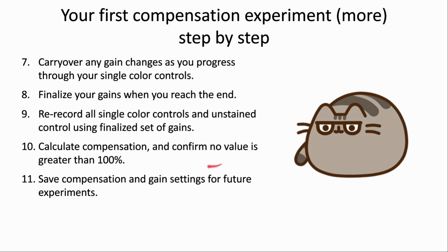Calculate your compensation and confirm that no value is approaching 100%. Save the compensation and the gain settings for future experiments and check your multicolored sample to see how the gating strategy and your compensation work in practice.